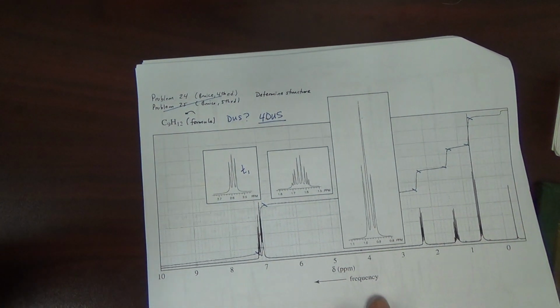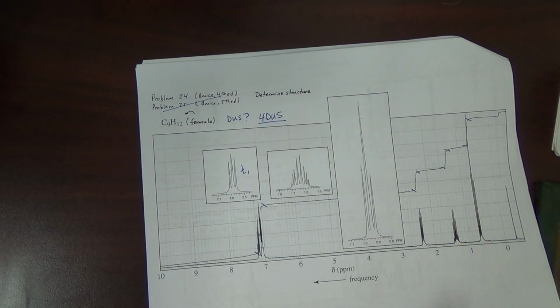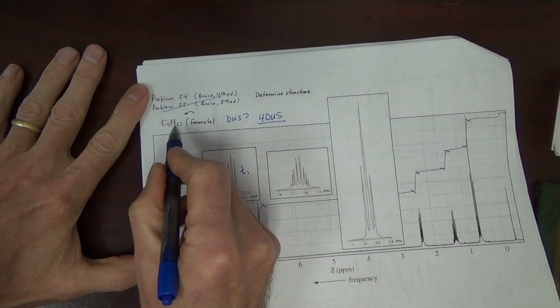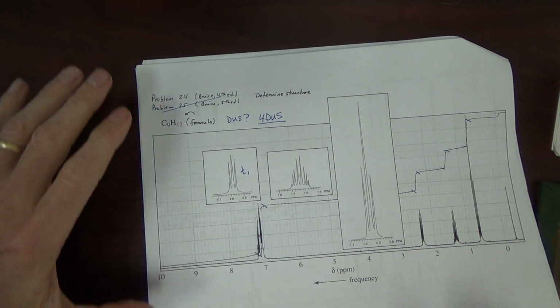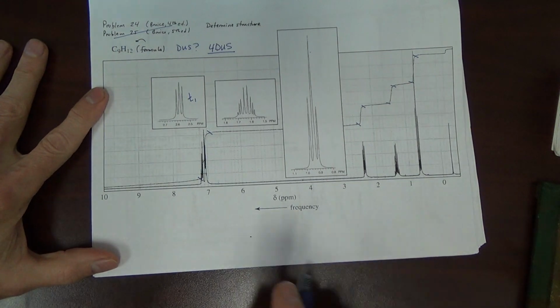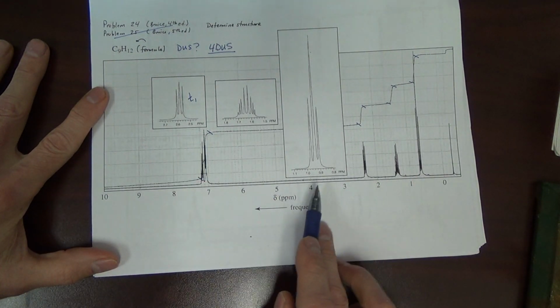That's good information. That tells us that the structure has, for example, 4 double bonds, or 4 rings, or a combination of those, such as 2 rings and 2 double bonds, etc. So, good place to start if you have formula. Alright, so let's look at the Proton NMR. We've got our baseline here. We have peaks. Some of the peaks are expanded.